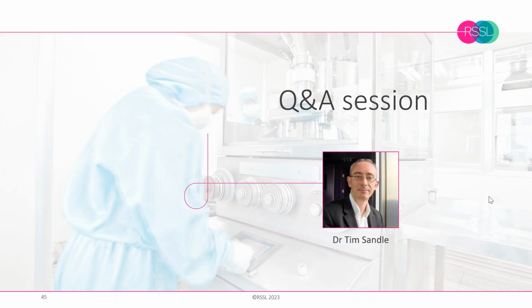No problem. So possibly just one more question then. Paul asked, what is the main cause of glove leak failures? It can be poor design, poor choice of materials, or the sterilization process. It can be not changing them frequently enough and subjecting them to repeated hydrogen peroxide exposure.